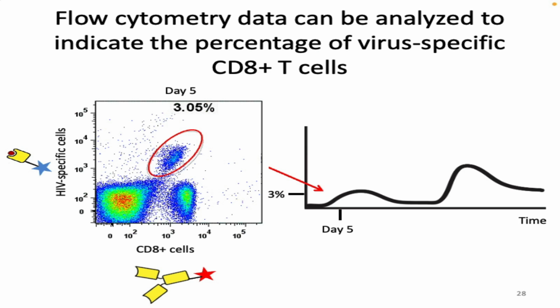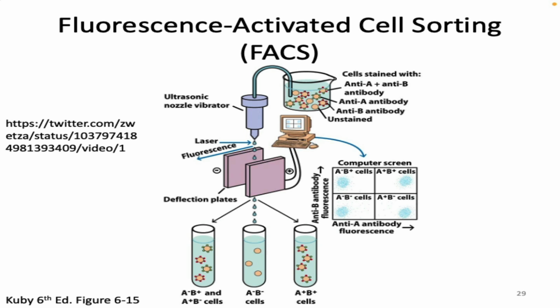So I am always going to talk about all of this as flow cytometry. Some people talk about everything that you've seen here as FACS, shown here listed as FACS. If you hear about FACS from people who are not being super picky like me, they might mean flow cytometry, what I've told you guys as flow cytometry. If we're being super technical, FACS is a specialized kind of flow cytometry called fluorescence activated cell sorting.